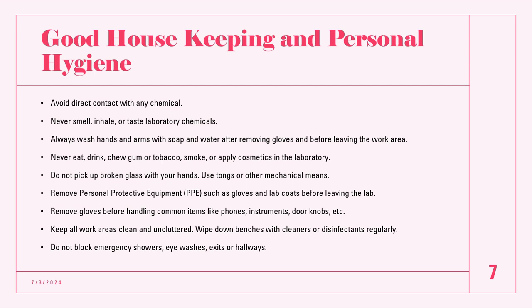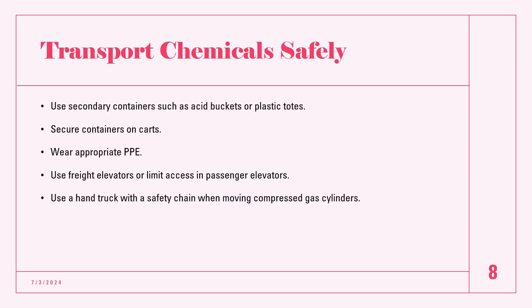Remove personal protective equipment such as gloves, lab coats before leaving the lab, and remove the gloves before handling common items like phones, instruments, doorknobs, etc. Keep all the work areas as clean as possible and uncluttered. Wipe down the benches with cleaners or disinfectants regularly. Do not block emergency showers, eye washes, exits, or hallways.